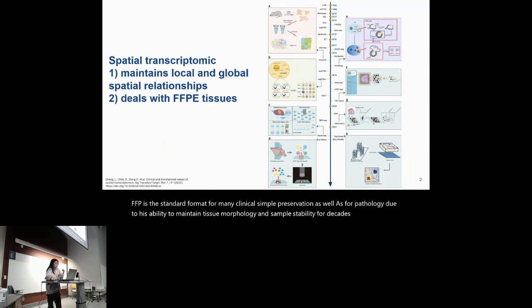And the ability to process these kinds of samples would enable the use of archival tissue banks for studies and obviate the need for specialized sample harvesting workflows. So to summarize, spatial transcriptomics has really provided researchers with the opportunity to advance therapeutic approaches, investigate these complex biological processes, and develop novel diagnostic methods and many more.